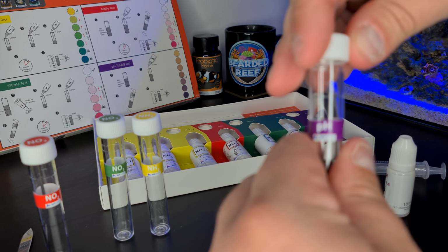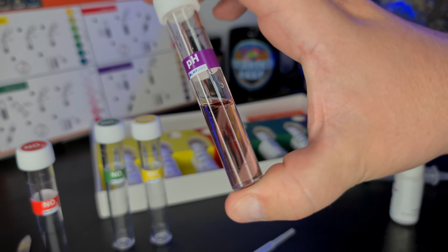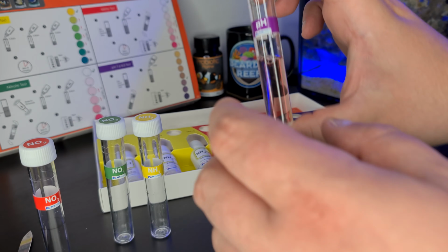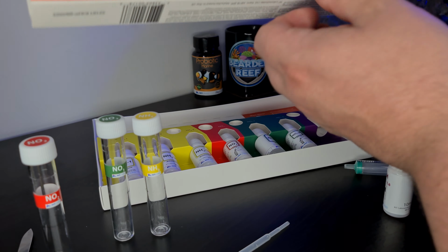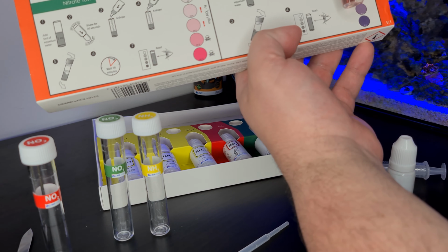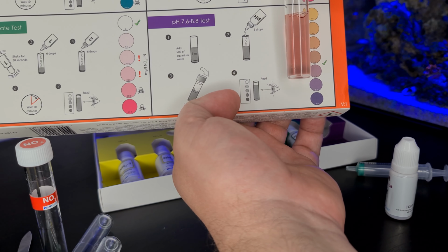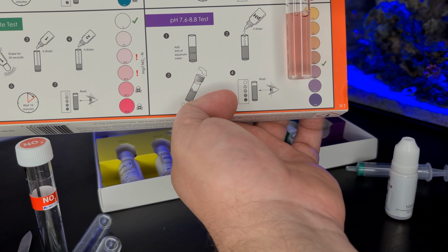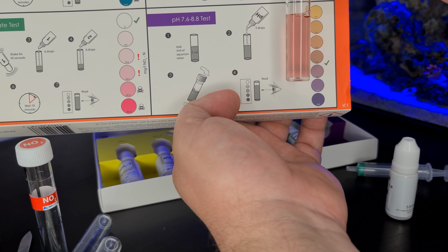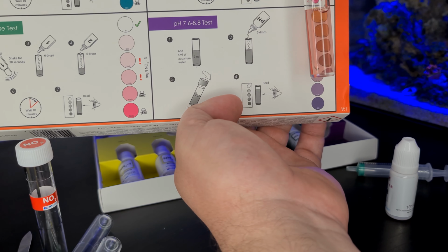It says give it a shake a couple of times, so I'll just invert this. And then I believe you read this from the side against the chart to see what we're at. So if I read that on here, I make that about 8.2, I would say. I know on the screen it looks maybe a bit closer to 8. In fact, it could be closer to 8 actually on this test. So yeah, we could say that's reading 8 on this for the pH.